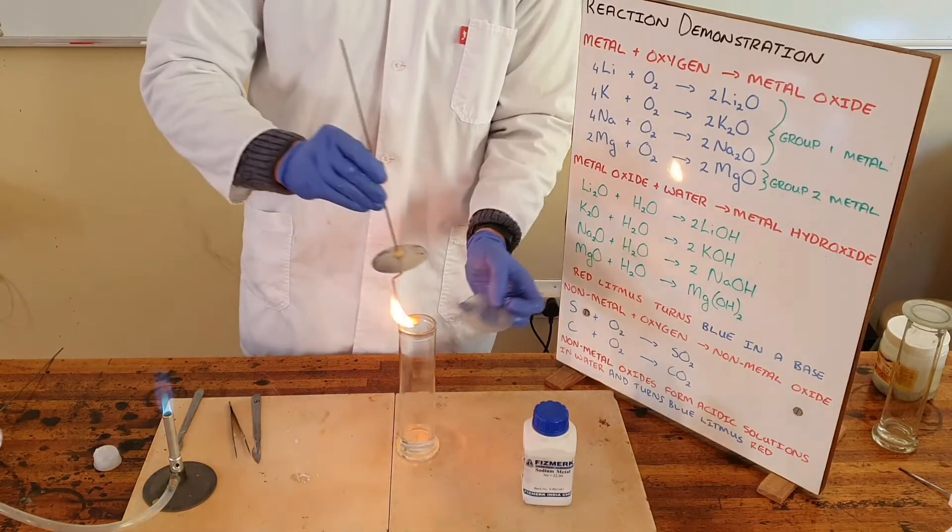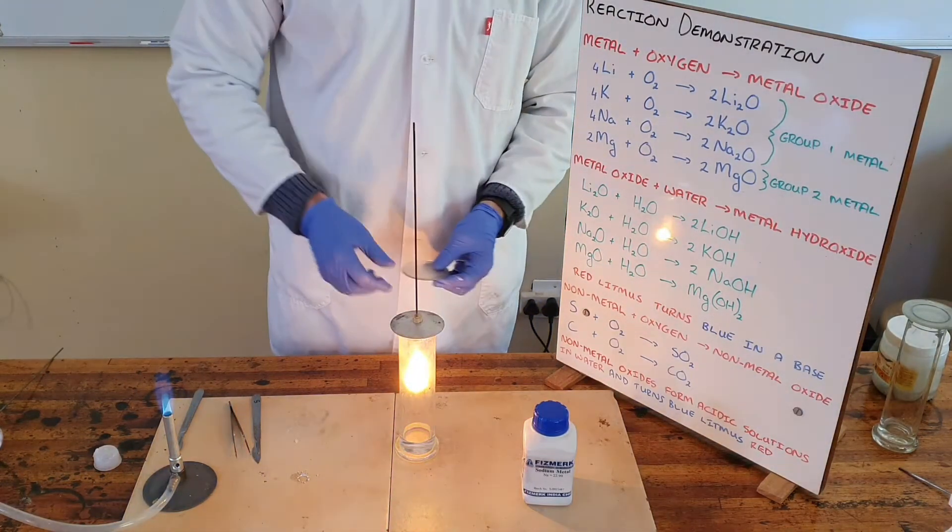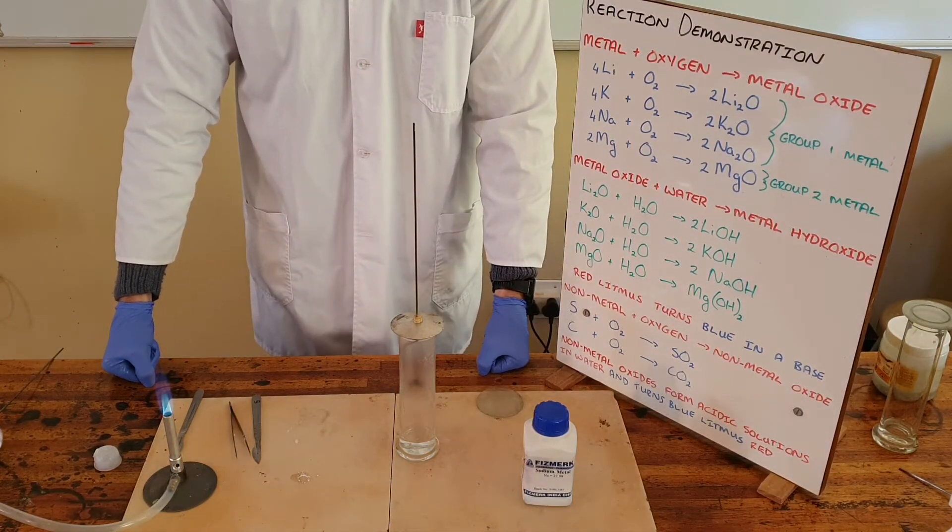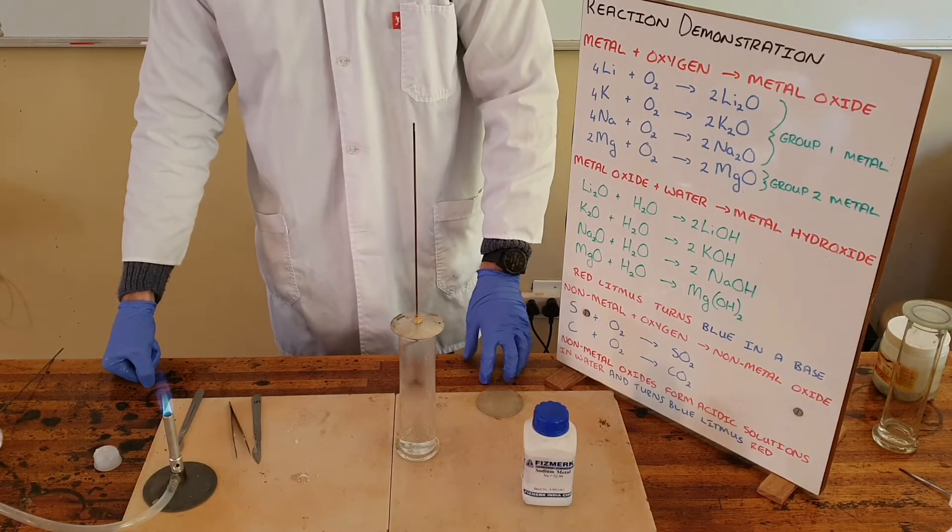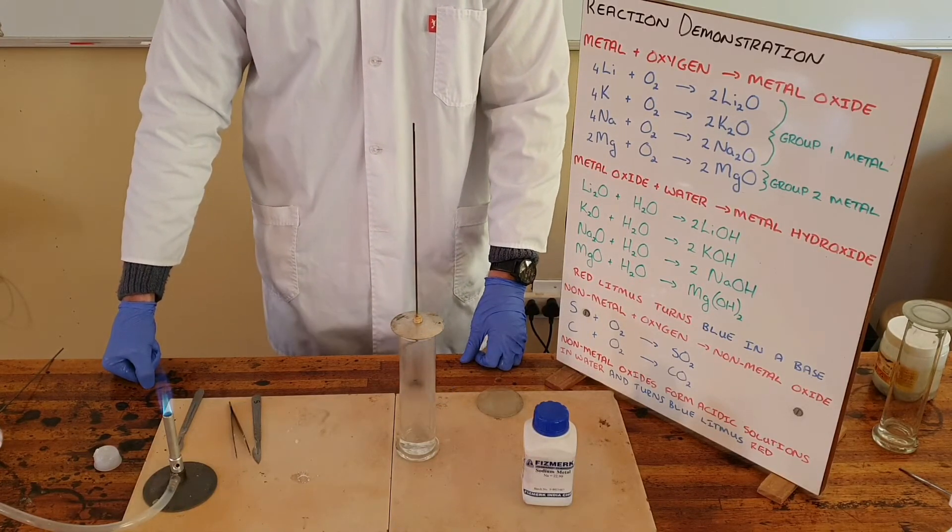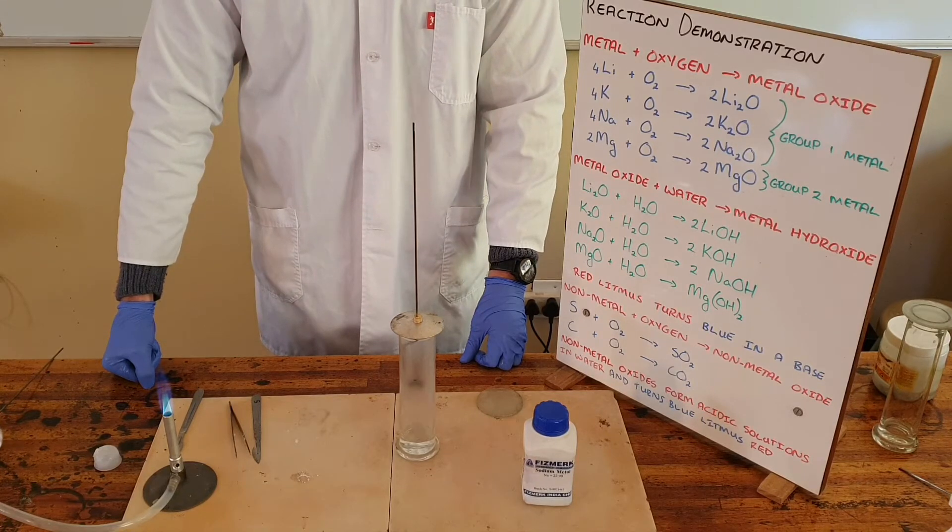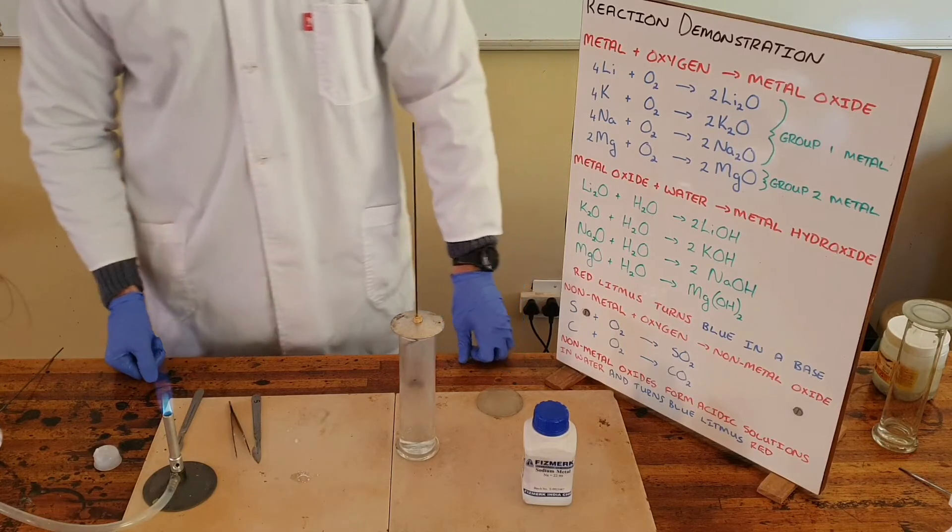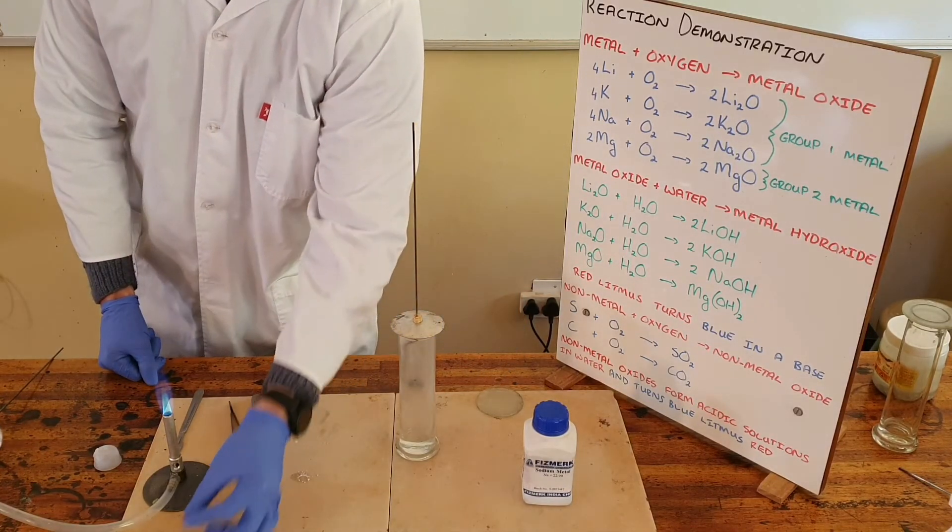You can see that it is burning, and we are in the process of forming sodium oxide. That sodium oxide is now mixing with the water. We know the general equation: when a metal oxide reacts with water, we form a metal hydroxide. Those metal hydroxides are basic or alkaline solutions, which means when we add red litmus paper to that solution, it should turn blue.